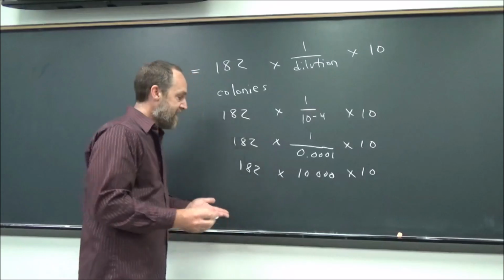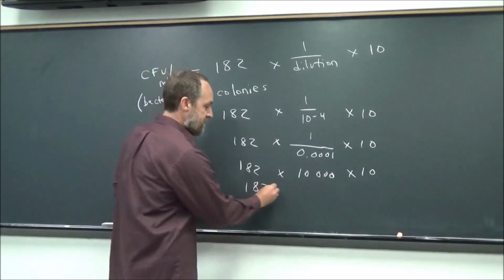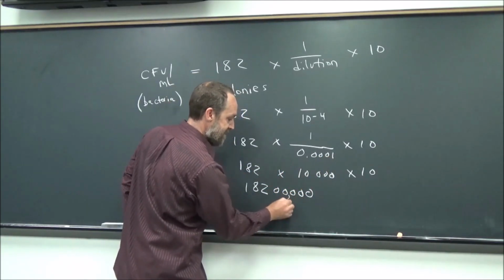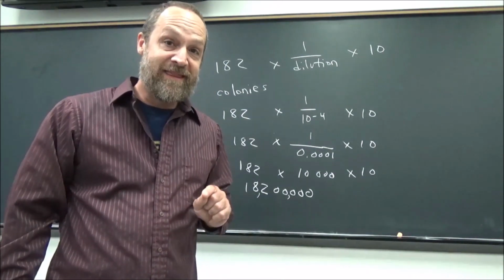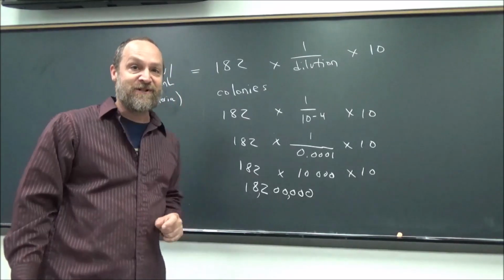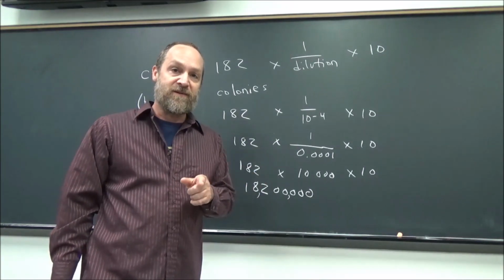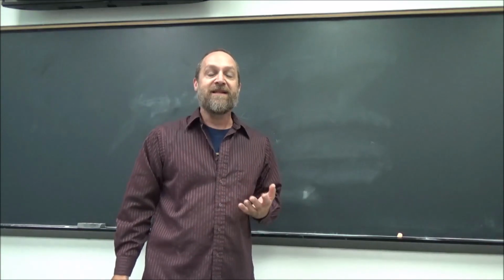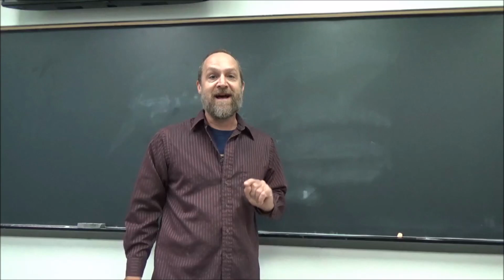Look, I don't even need a calculator. That's 182, and then 4 zeros, and then 1 more 0. So that is 18,200,000 bacteria per milliliter in that original culture tube. So you want to make sure you know how to do this calculation, and also let me show you the dilution calculation. Okay, for your dilution calculation, let's pretend you add 1 milliliter into 999 milliliters.